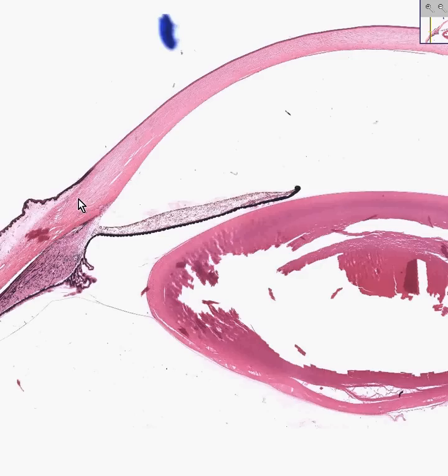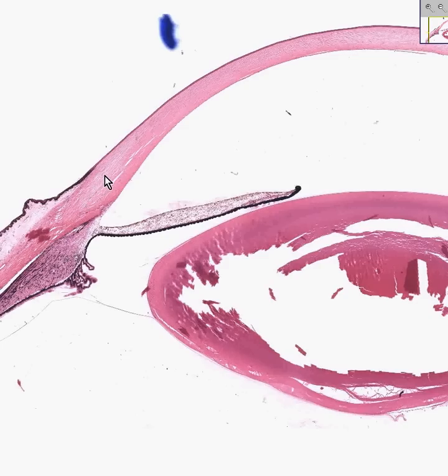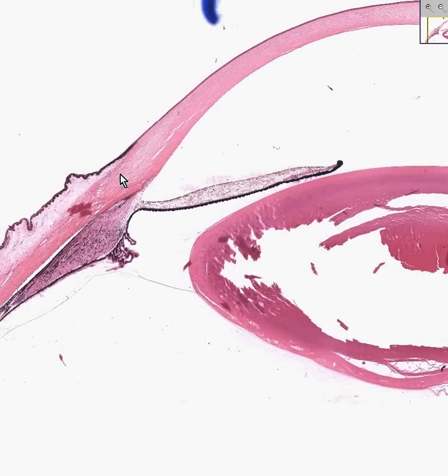The middle tunic of the eye is called the vascular tunic. It's also very, very pigmented. It consists of the iris over here.